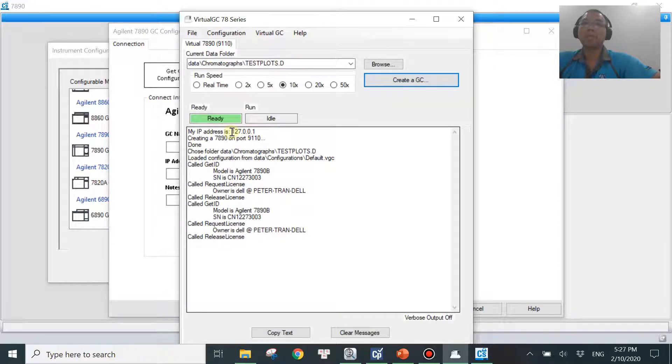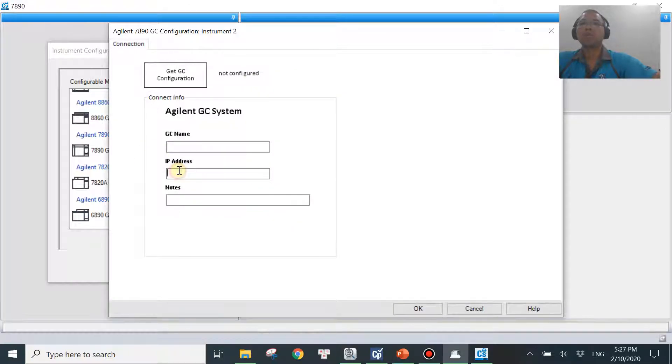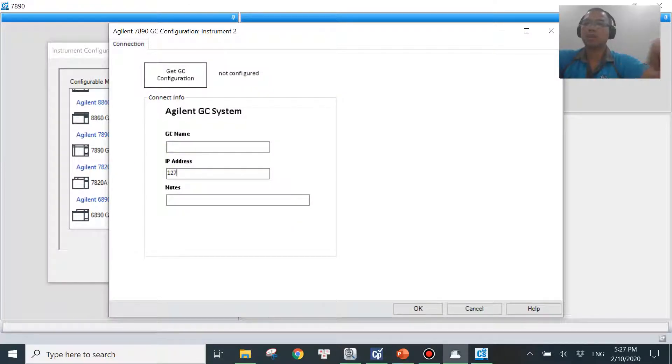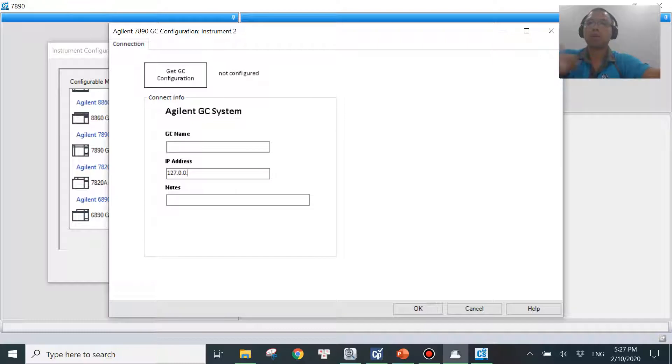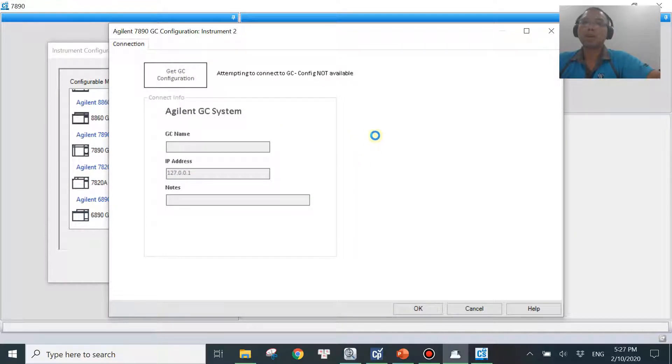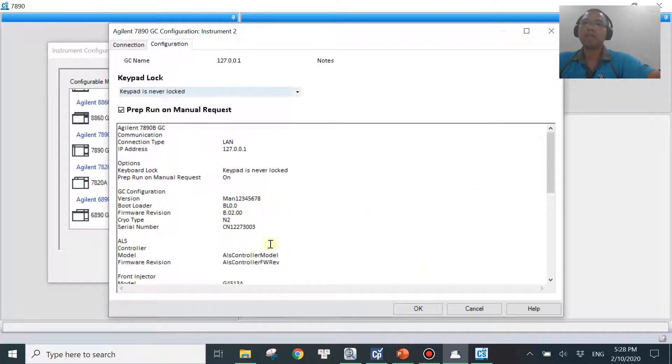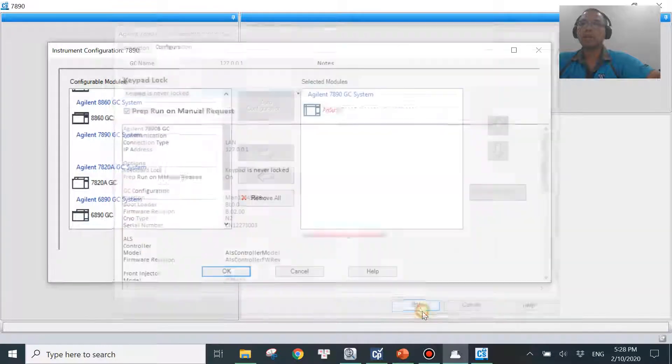But I do have the IP address here. 127.0.0.1. What I'm going to do, I will key in that IP address over here. .0.0.1. Right. Then you will hit the get GC configuration to make sure that the communication is back. Give it a few seconds. So once it's okay, then you will see the configuration will appear over here. Then you just hit okay.